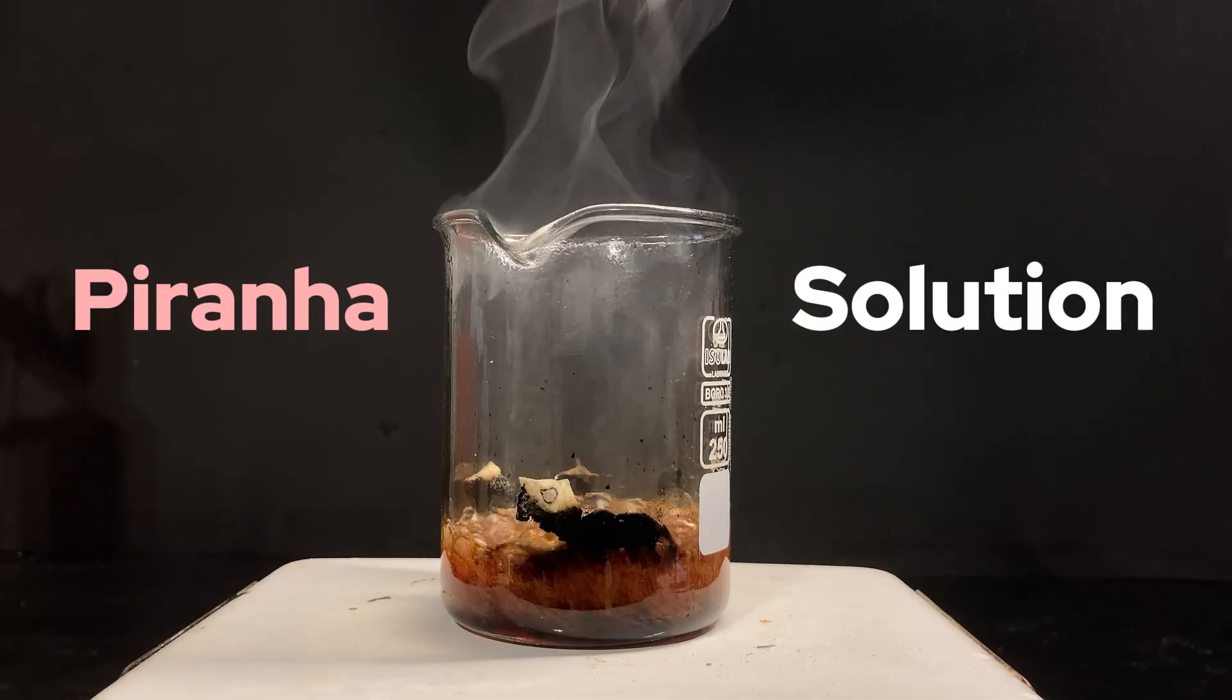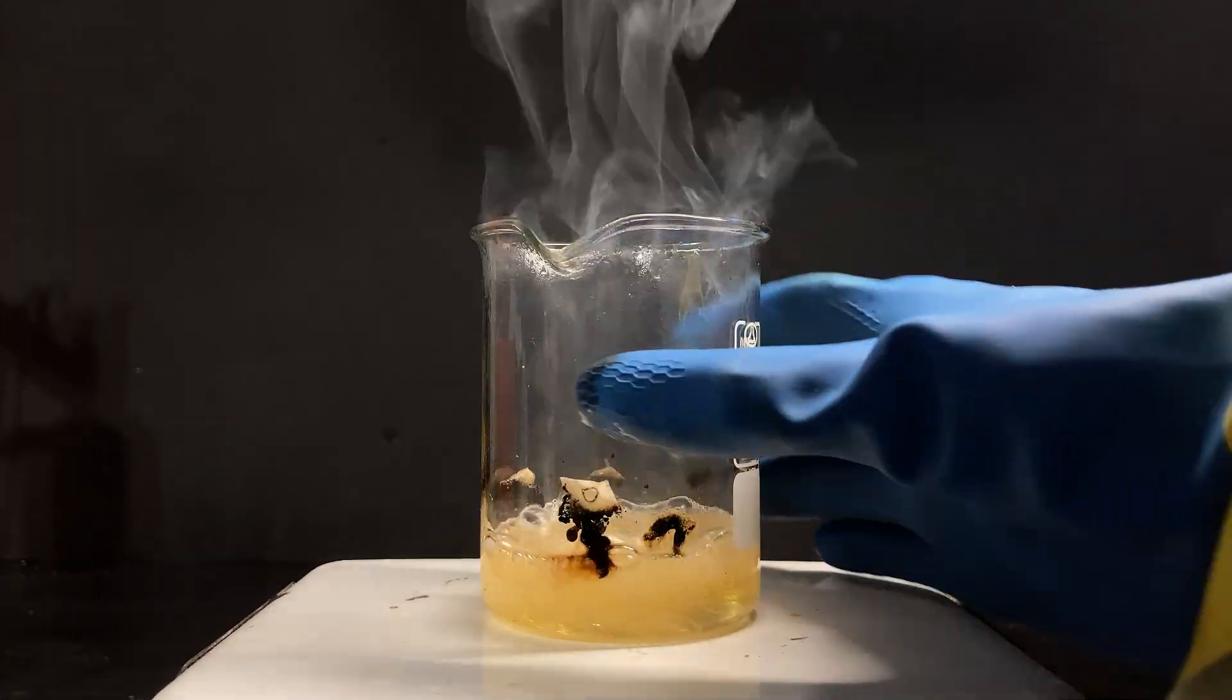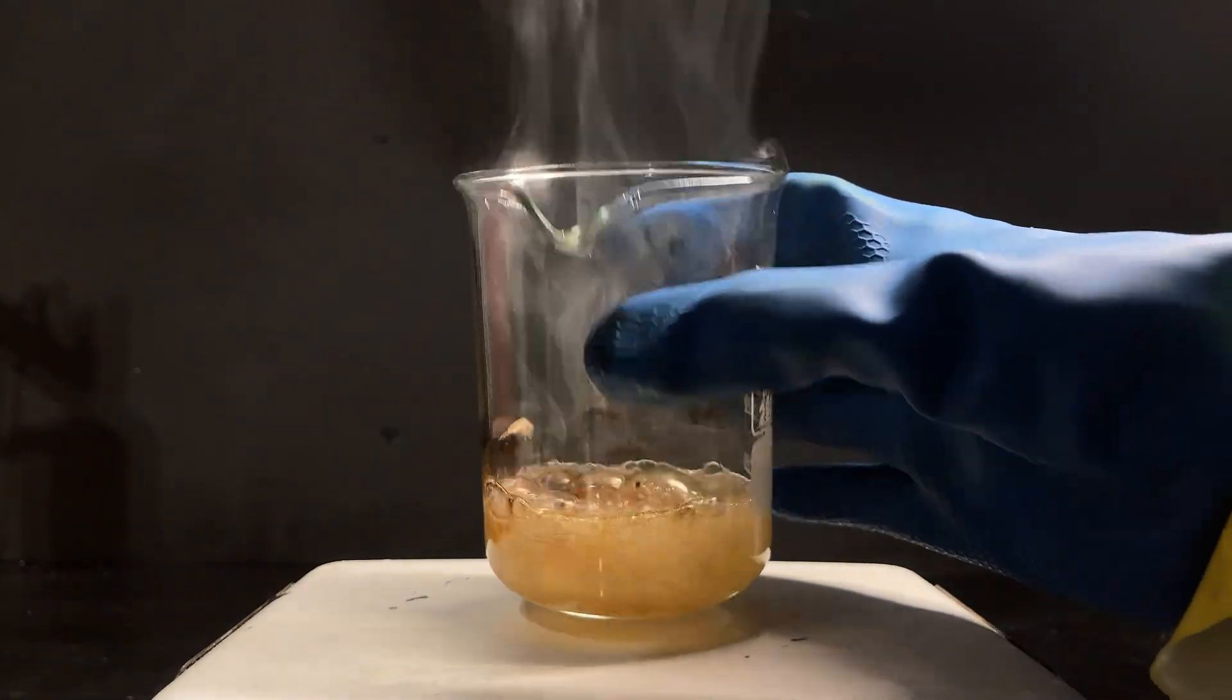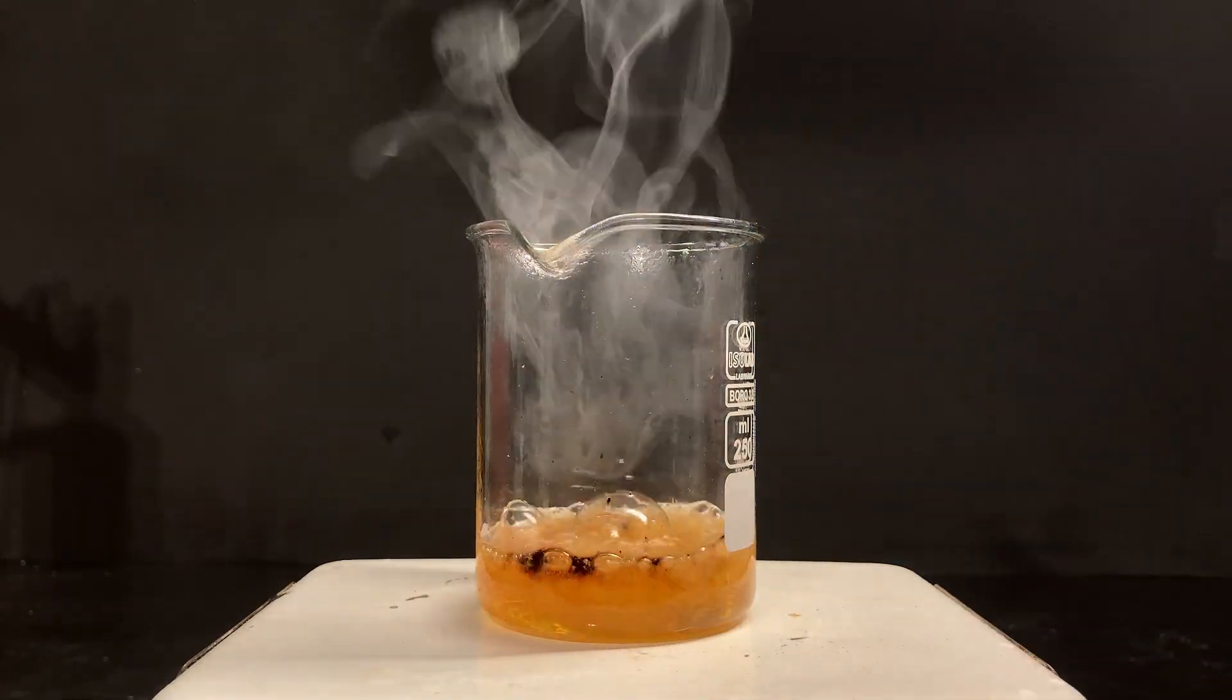It is an extremely strong oxidizer and is thus often used for cleaning glassware in laboratories. It is also probably what we all imagine acids to look like as kids. This solution is extremely dangerous and requires appropriate PPE.